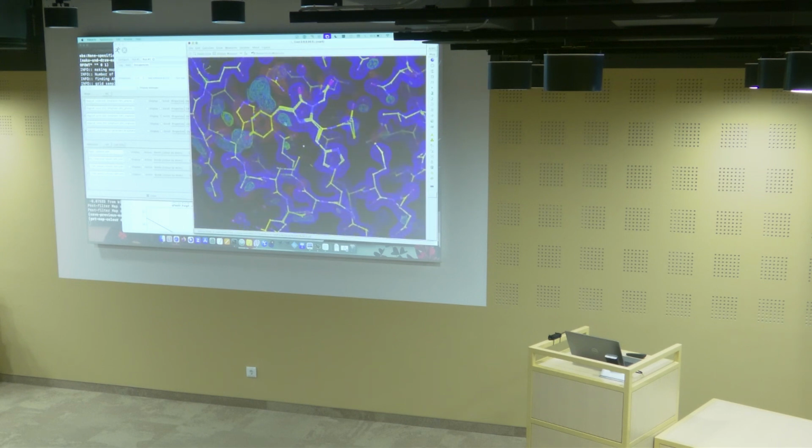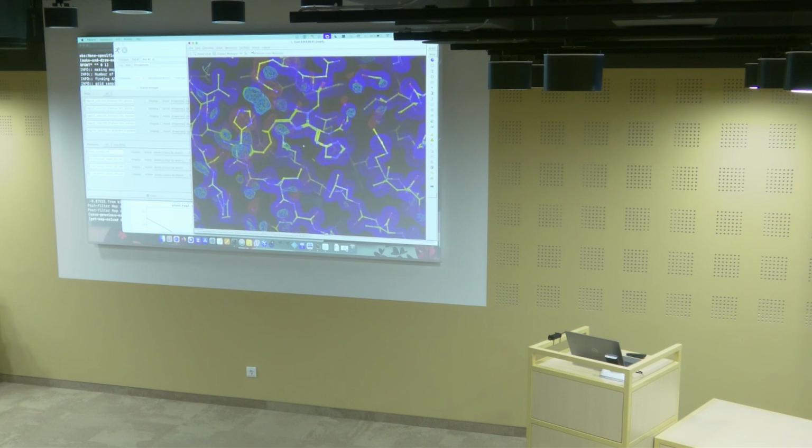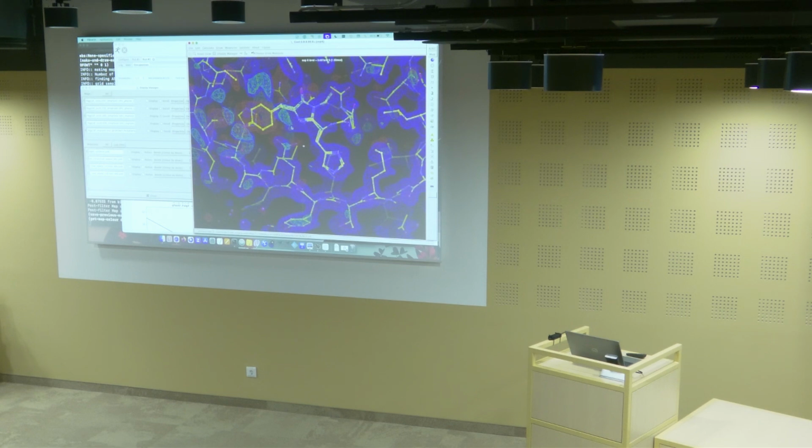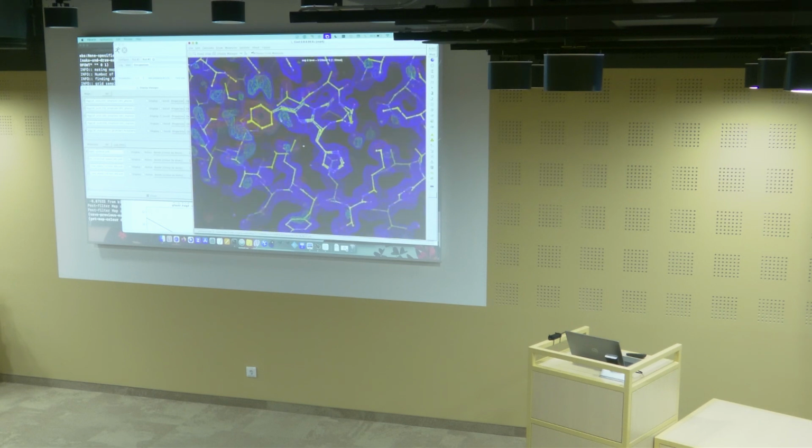Here now we have the extrapolated map, so this is still unrefined, where we have this difference map. The difference map, in green and red, resembles that Fourier difference map a lot. And then we also have the equivalent of the standard 2FoFc map in which we can model things. And then we have another map from refinement and other models from refinement.